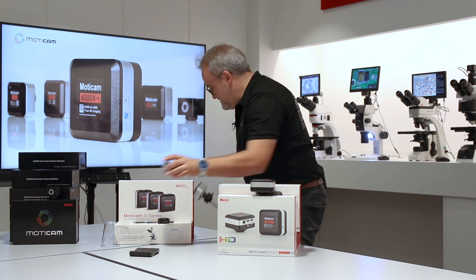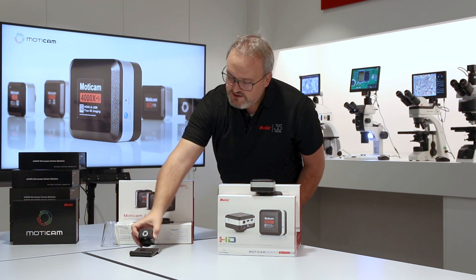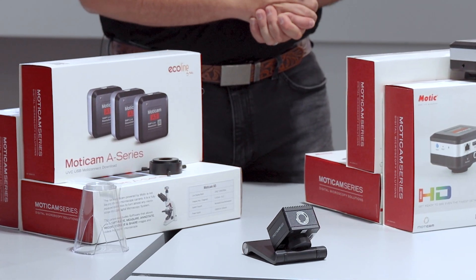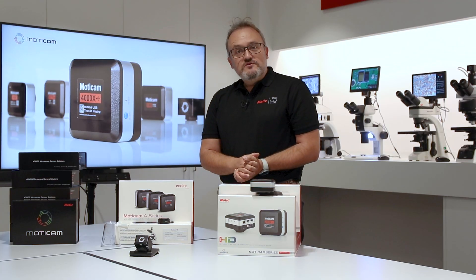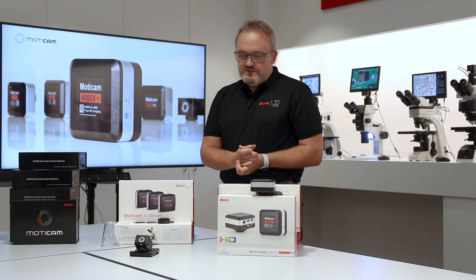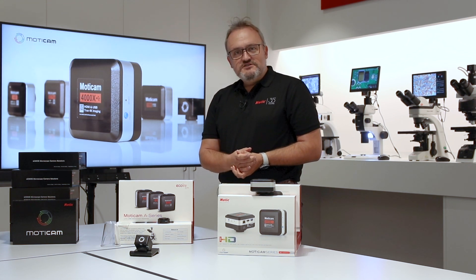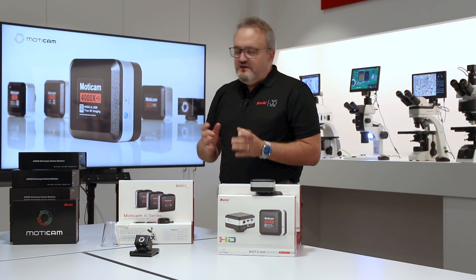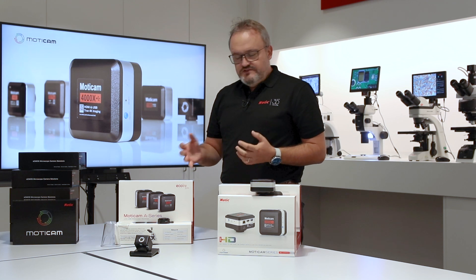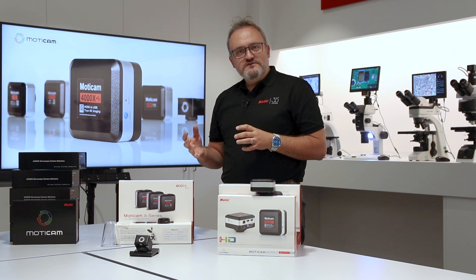The last camera line I'd like to show you is the professional line, the S-Line. If image quality, color reproduction, and clarity are the most important things for you, and you have a professional microscope with a trinocular output, then the Moticam S-Line is the right solution. It comes in different resolutions all the way up to 20 megapixel live reproduction, with different shutter modes.